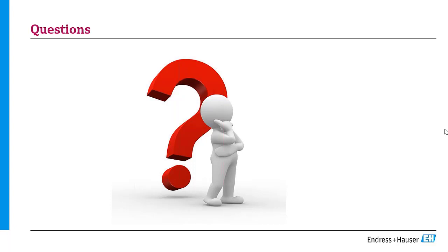That's a fantastic question. The EPA regulations dictating that white light is necessary are only a requirement in the US. It was very unfortunate that the CUB 21 and 22 were phased out quite abruptly, but the factory is looking into alternatives, and they're exploring a new white light turbidity sensor and are currently in the process of getting it EPA approved.